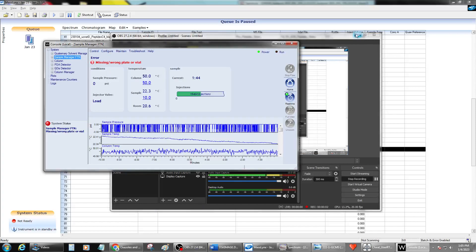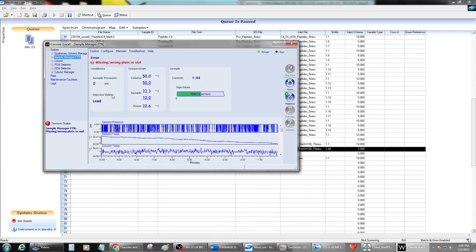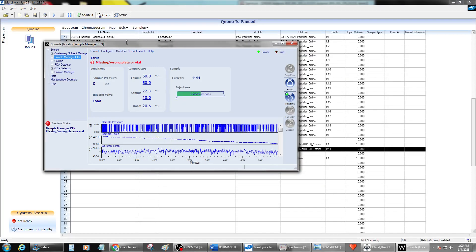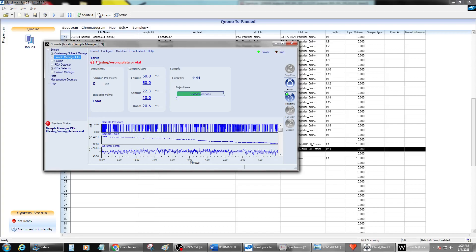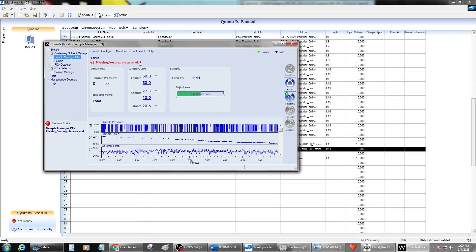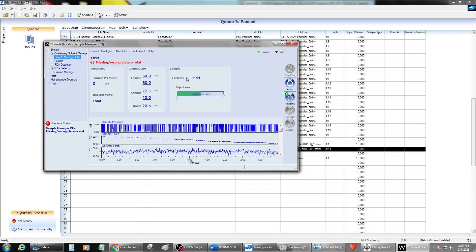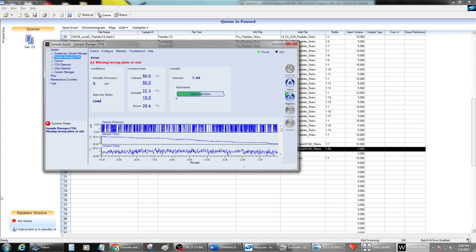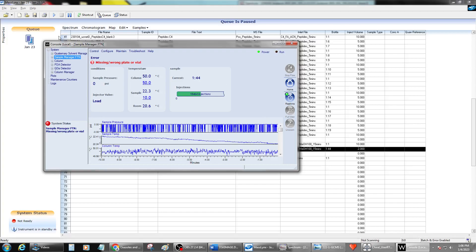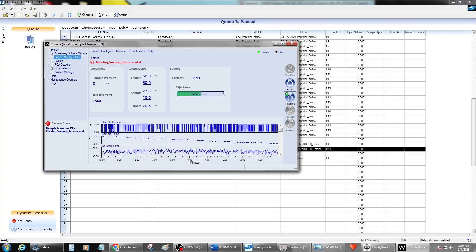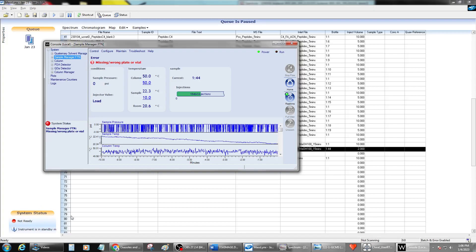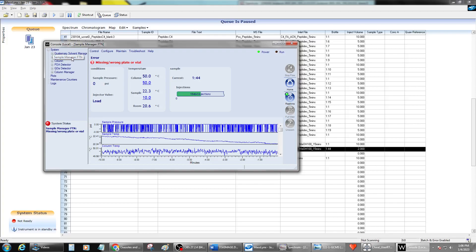So here's a really common mistake. Happens far too often. Missing vial - you'll see it's a missing vial, wrong plate. So clearly there's a vial in the wrong position or somebody put it in the wrong vial position here in the sample list. And so it is paused. You can see the instrument is off and we have an error on our sample manager.